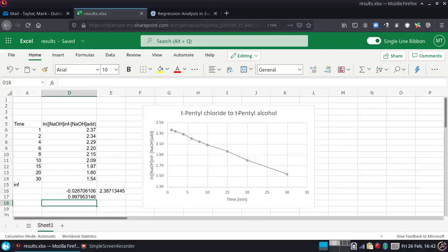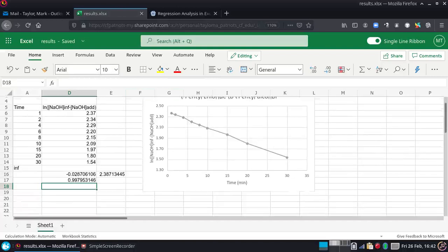So we're not going to graph our trend line per se, but we actually can get our data, and we can talk about our r squared and mention that we're very close to having a very straight line. So give me the chart, make it nice and pretty like that, and then tell me something about your data. So what your equation for that line is, what your k is, because that is that value right there, the 0.0287 is my rate constant. And the 0.997 tells us how confident we are that this is good data. And the closer to 0.99 you have, the better the data is.